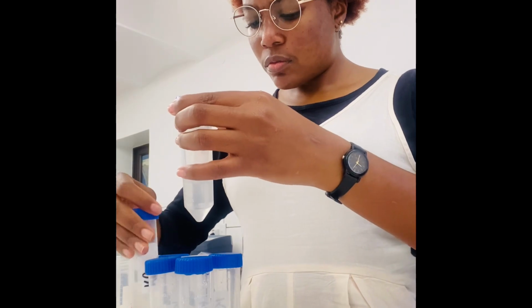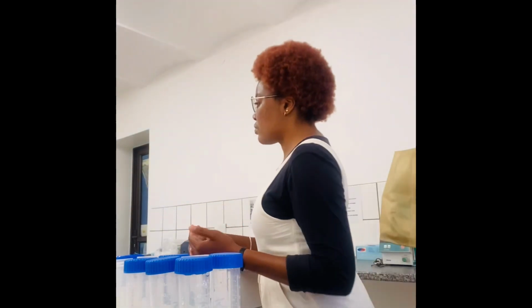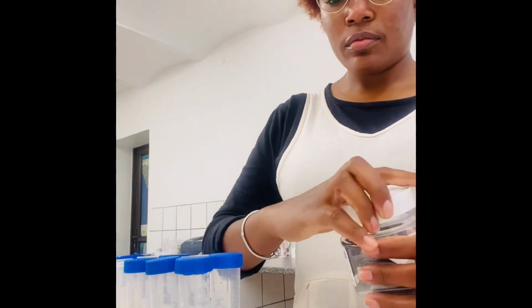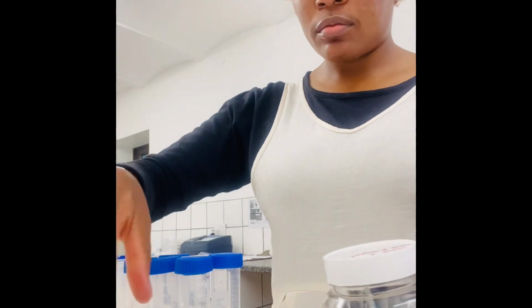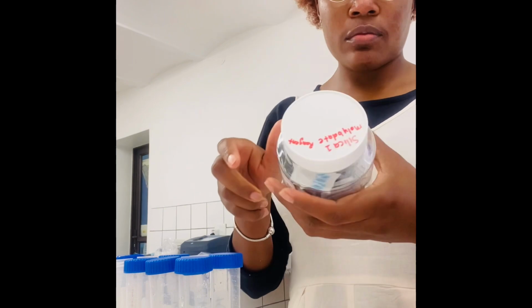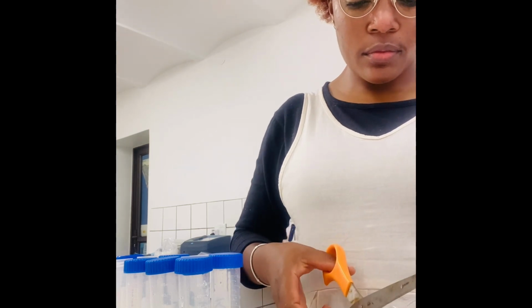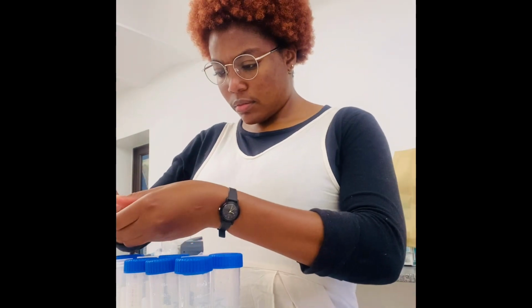At the end of the video, you'll be able to see a few pictures of phytoplankton species that I found in the water today, and it was quite a rich sample. So we call that a bloom when we have multiple organisms, or rather species of phytoplankton in the water. Sometimes we can have one type of species, but so many of it, that can also be referred to as a bloom.